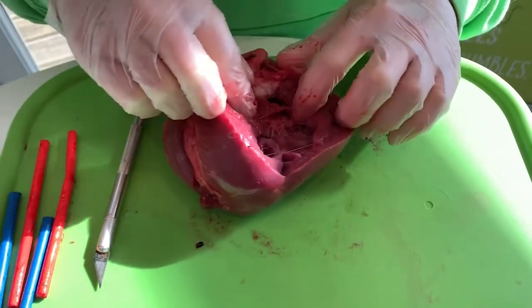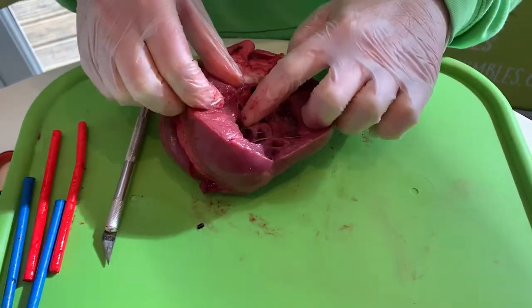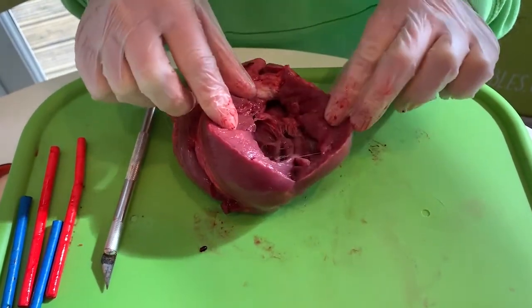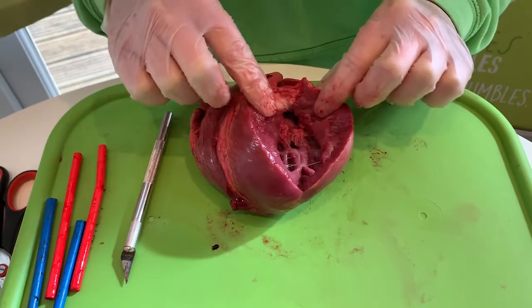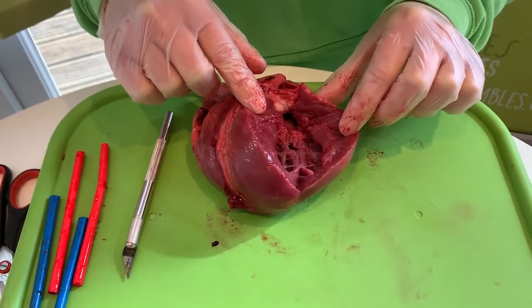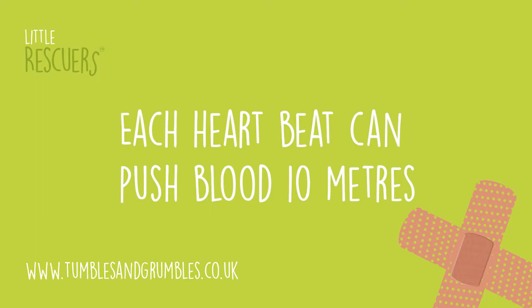So let me see if I can break some of the heartstrings. They're mega tough. They're hard to break, okay? Well, they are really hard to break. Super, super tough. In fact, I can't even do it. But it's important that they're tough because they help our heart beat. And remember that this is the most important muscle in our body because it keeps us alive. And if our heart beats, it can push blood 10 meters. So it's really, really strong and really, really forceful.